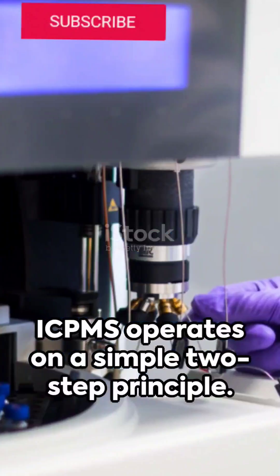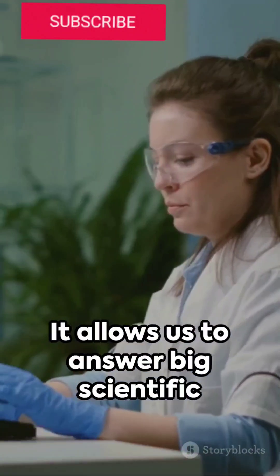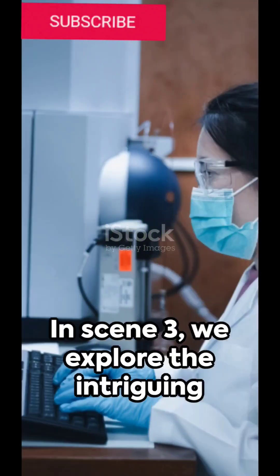ICP-MS operates on a simple two-step principle. Known for its high sensitivity, it has a wide reach, allowing us to answer big scientific questions.